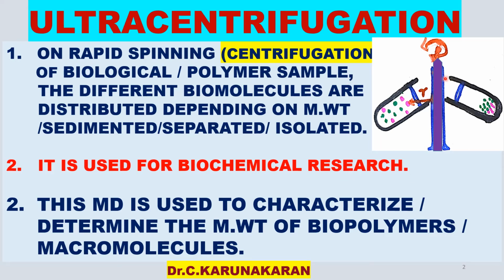This ultracentrifugation method is very much used for biochemical research and for macromolecular research. This method is therefore used to characterize biomolecules using the molecular weight. This method is used to determine the molecular weight of biomolecules, biopolymers, etc.